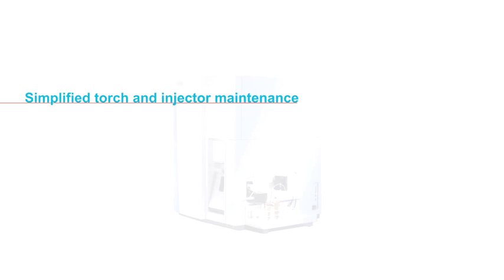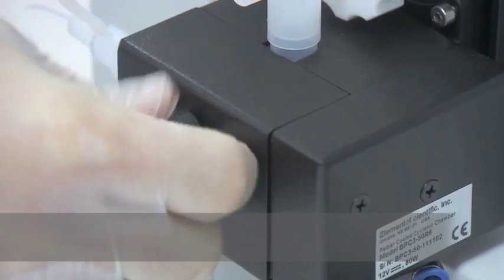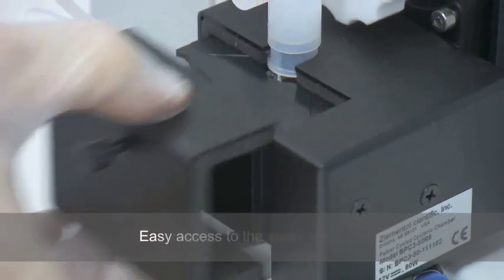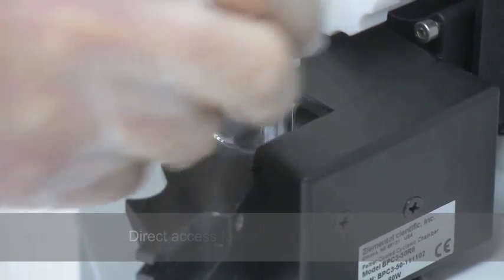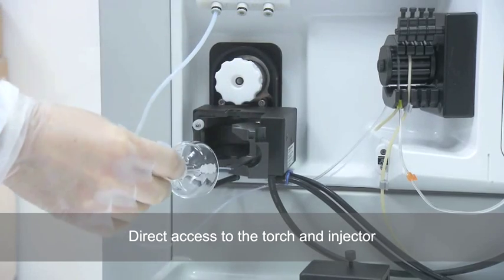Simplified torch and injector maintenance on the Thermo Scientific ICAP-Q ICP-MS. Tool-free removal of the Peltier casing provides easy access to the spray chamber. Simple removal of the push-fit spray chamber allows direct access to the torch and injector.